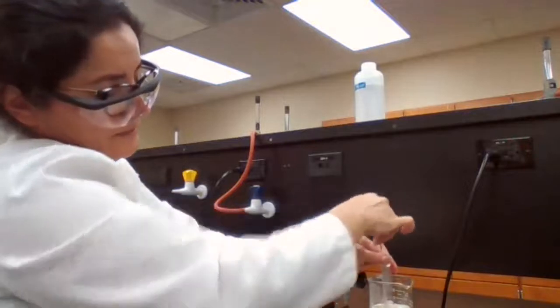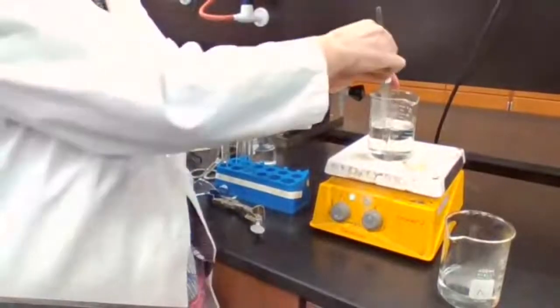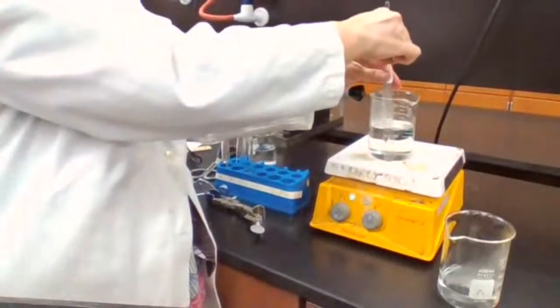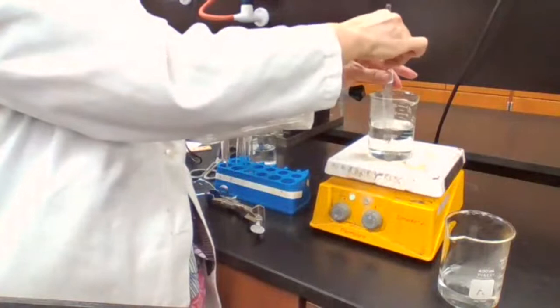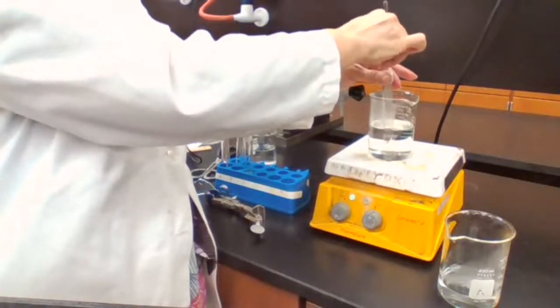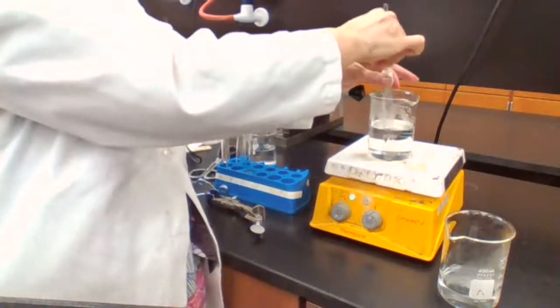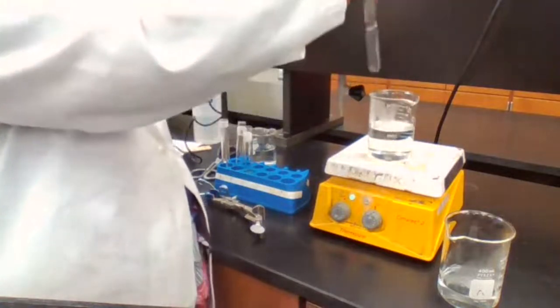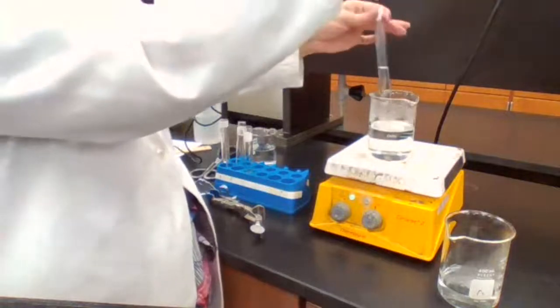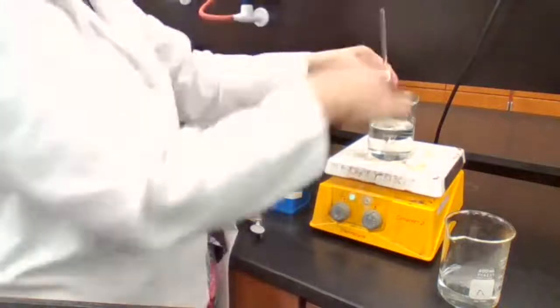Is it clear? I don't know if it's visible or not. Is it clear? Yes, it takes higher temperature to dissolve it. But we're trying to find the exact temperature at which it's going to dissolve, or at what temperature it will come back to crystal.